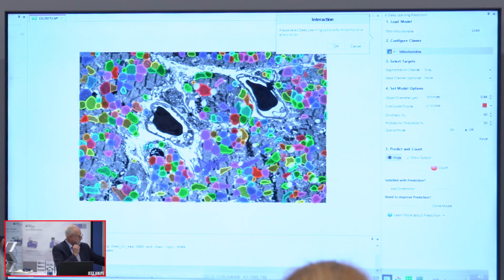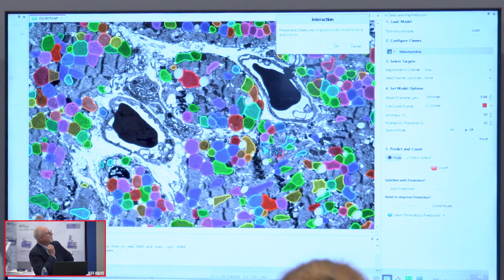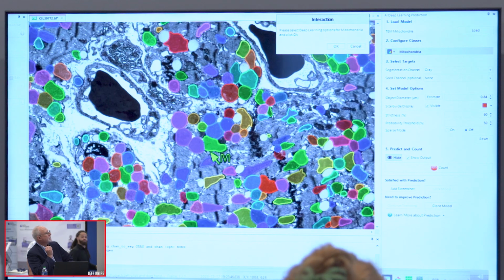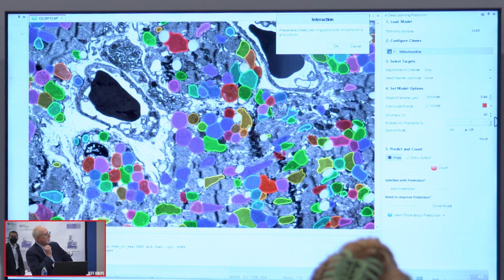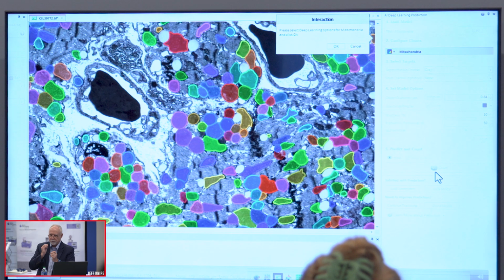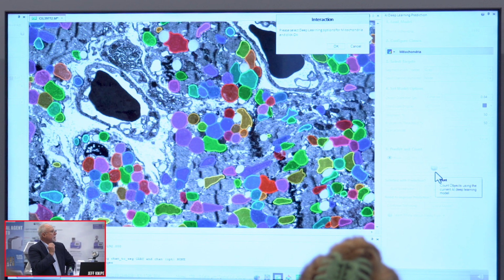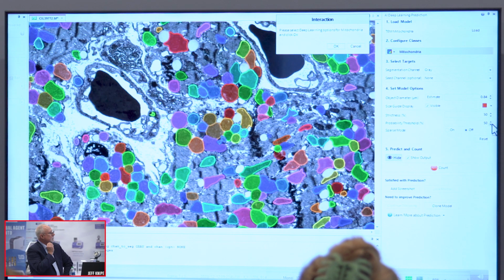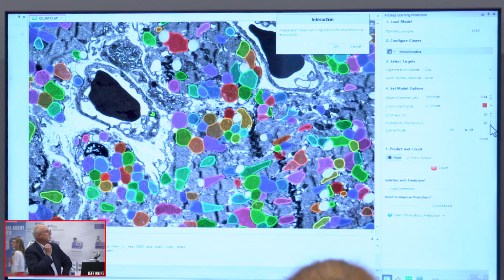So you can see here, it's just running the deep learning model, verifying that everything's correct. It's just doing an adjustment to see if I can dial it in a little bit better. Again, this is very straightforward and very quick and easy to do. Found them a little bit better. And then continuing on.